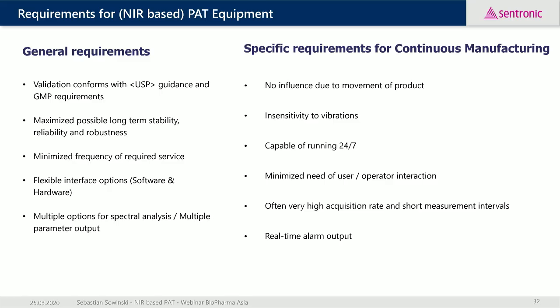And here it is even more important to minimize the need for any user or operator interaction, in the sense of doing standardization, external measurements, qualification, validation, calibration, whatsoever. As the system is installed, it isn't that easy to remove the probe and take it out to do some offline work.